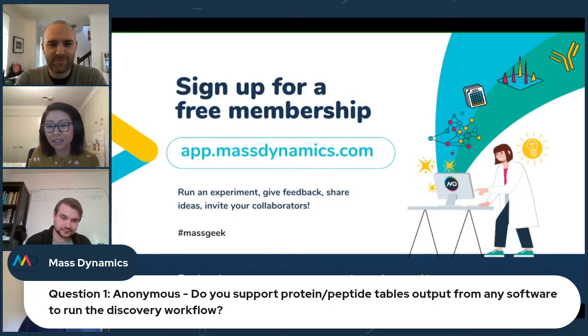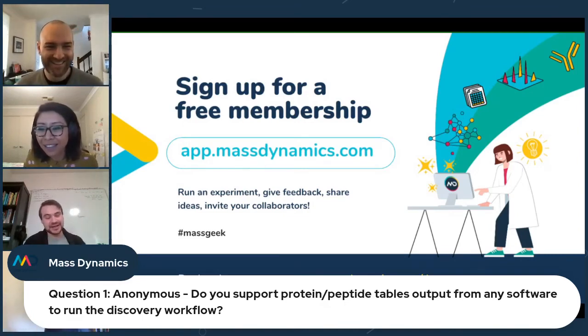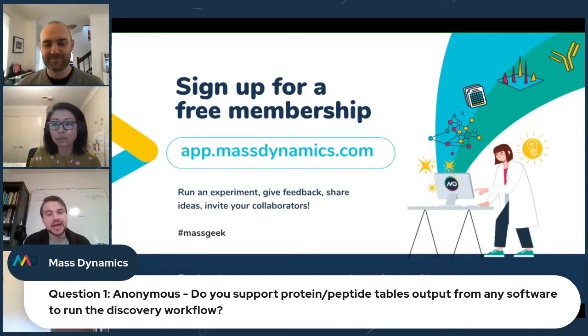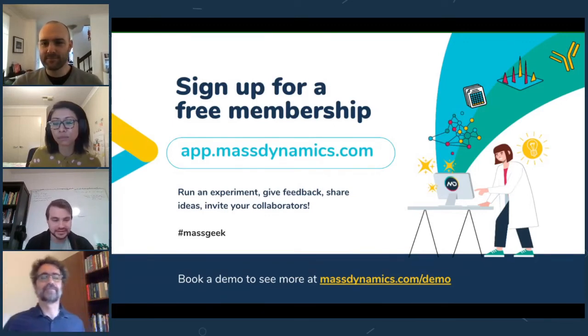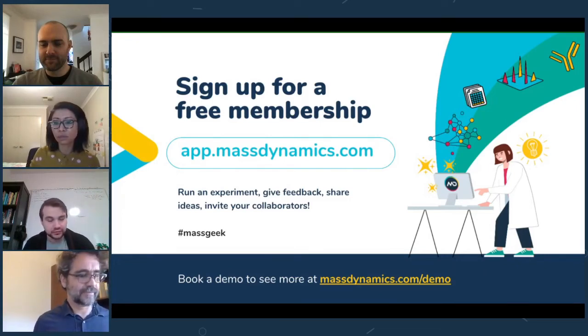Yes. Joseph, you can go. Okay. So currently we support MaxQuant preprocessed data for TMT and LFQ experiments, but we've also got a generic format for preprocessed data. So really any software that you process, a lot of them will produce this wide form protein expression output, and we've got this generic upload format, which is very easy to get any sort of table into, and then you can do your protein level differential expression analysis.